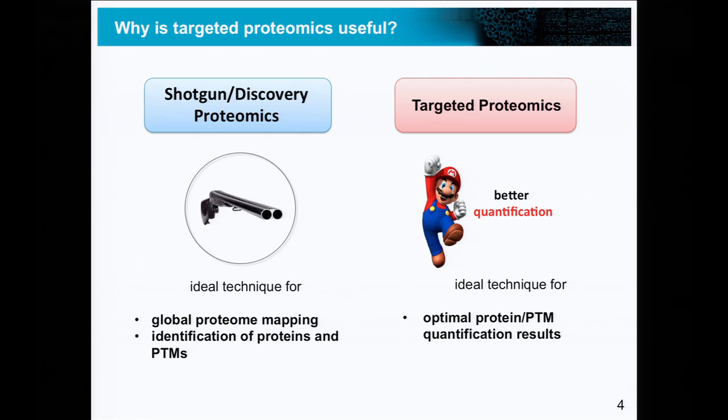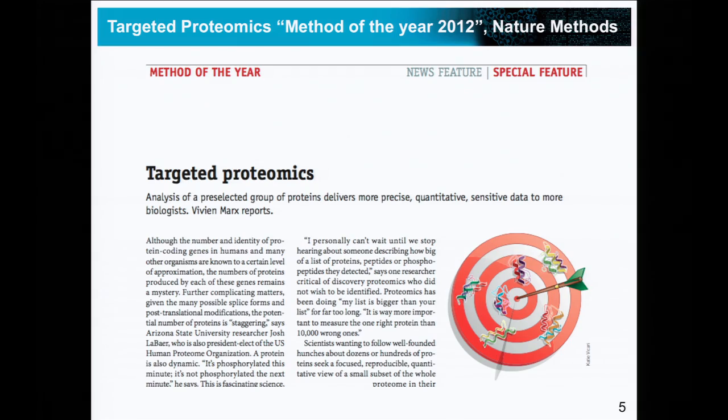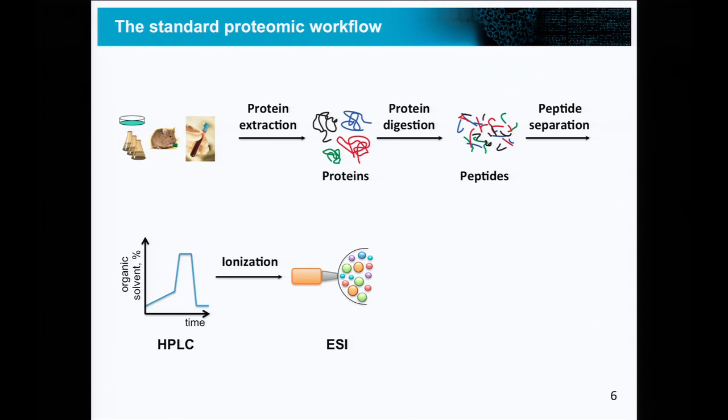And I think Rudy showed this already, very great in his presentation. And the fact that more and more people also acknowledge or recognize these advantages of targeted proteomics, you can also see from the fact that it was selected as Method of the Year in 2012 by Nature Methods.